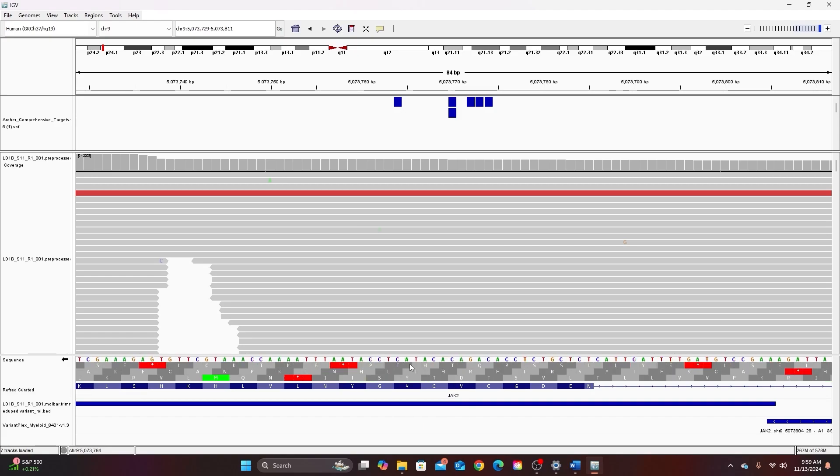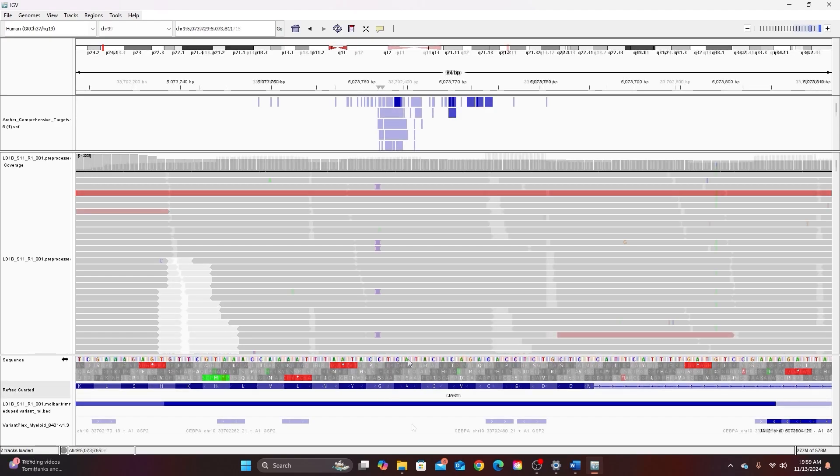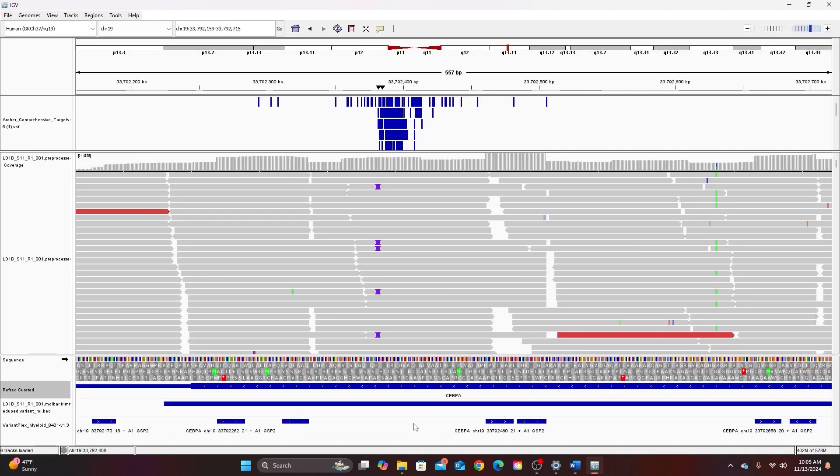This will give you the reverse complement of the sequence which is the minus or reverse strand. So none of the three translation frames would match the reference. Because in this particular part of the genome the reference is the positive strand, I have created that mismatch by flipping. But if we go to another part of the genome you can see what I'm talking about.